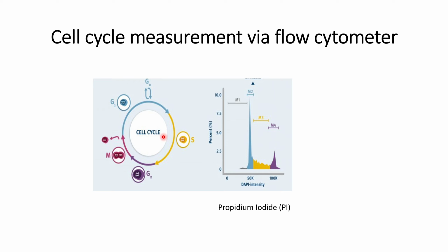the cell cycle. So before going into the main topic, let us first quickly revise what this cell cycle means and how DNA content is related to each cell cycle phase. Let us start with the G1 phase. In G1 phase, cells continue to grow. However, there is not much change in the DNA observed.